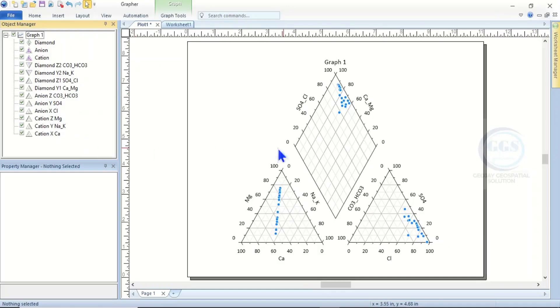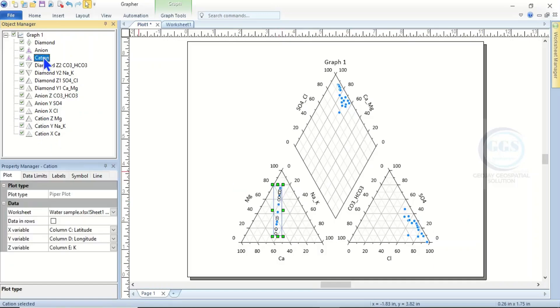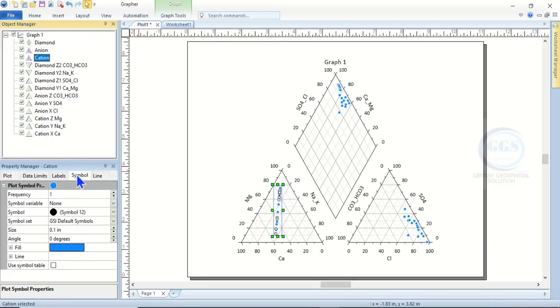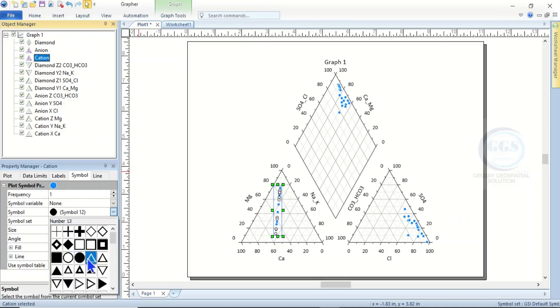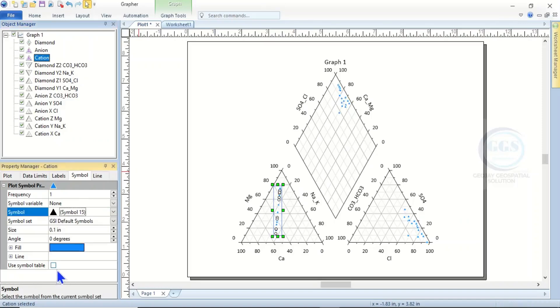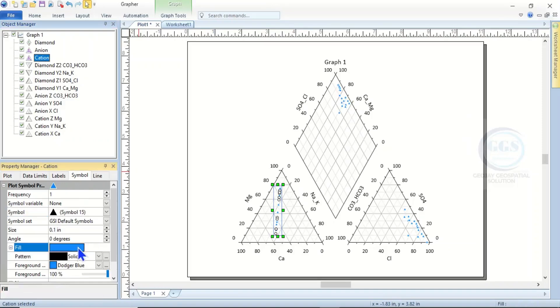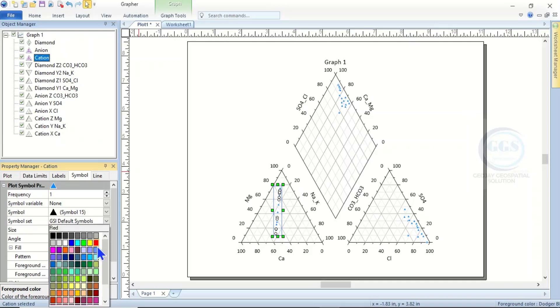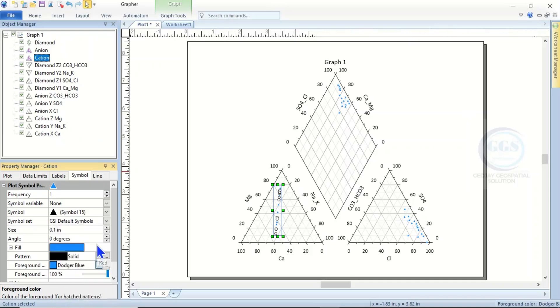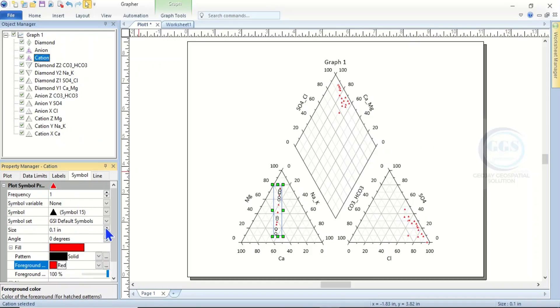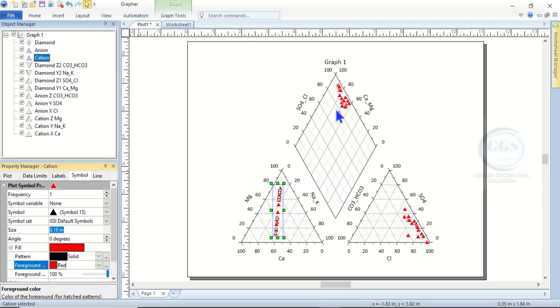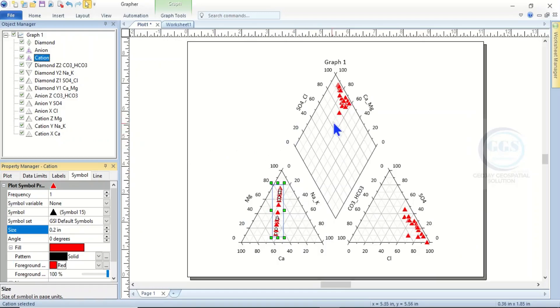Now what you can do is change the symbology. To change the symbology, highlight the cations and come to Symbol. Click on this symbol and change it to the symbol of your choice. Immediately you change it, it will be changed. Then here you can change the color - let's change the color to red. Then you can increase the size here. You can see as you are increasing it, it is increasing. This is the cation, the anion, and the diamond.